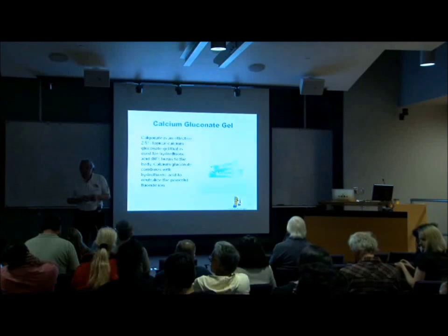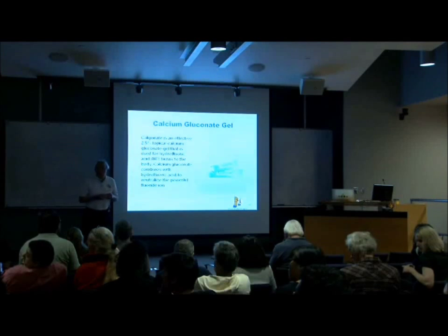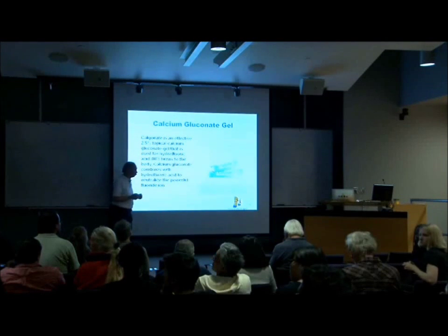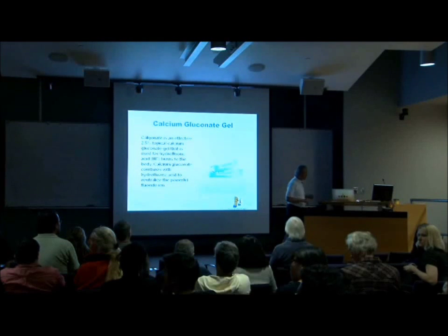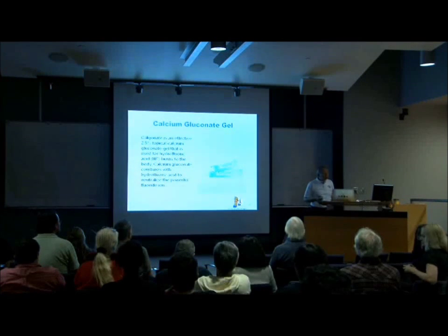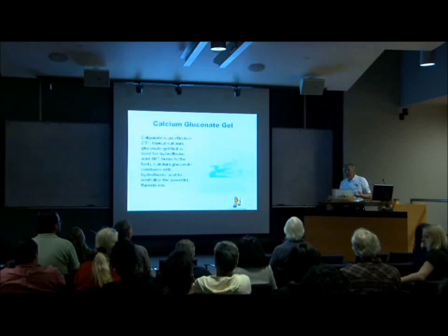Yes, sir. I just want to follow up on something you said. If you do use corrosive gases, please do order in quantities that you can turn over quickly. It wasn't that long ago where I had to figure out a way to disengage a corrosive gas from a system that had been left in place literally for years, and the valve became virtually unusable. So take a good look at it and make sure that you are ordering appropriately. Yeah, you have an excellent program which we're going to continue to grow and expand, but it's only good if you know it exists, right, and you use it.